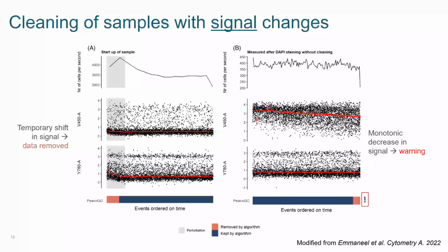Okay, so it's not actually cutting out this entire data set, because there'd be no way to really do that since it's gradually decreasing over time, but it at least makes you aware that that is present. So you can be aware of that and possibly just deal with it accordingly in your analysis.